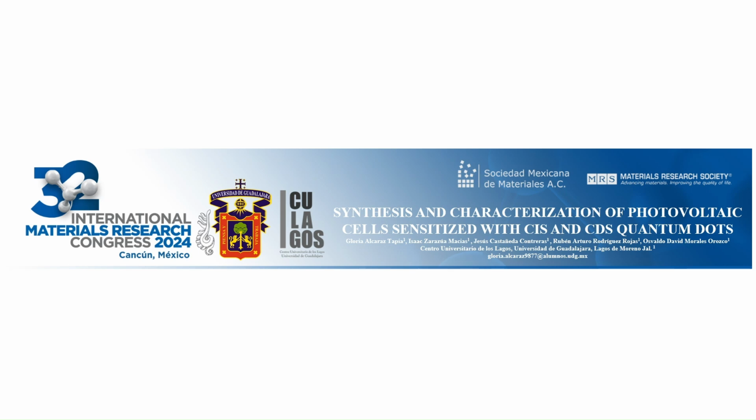Synthesis and characterization of photovoltaic cells sensitized with CIS and CdS quantum dots.